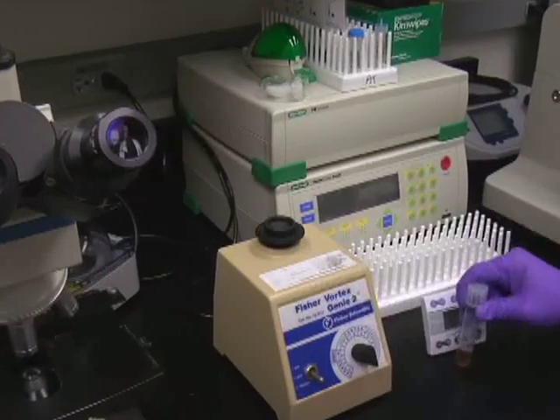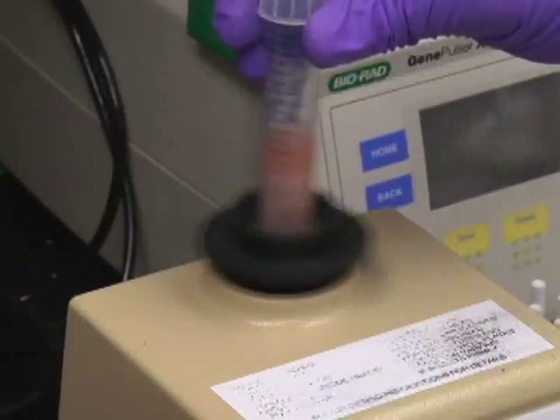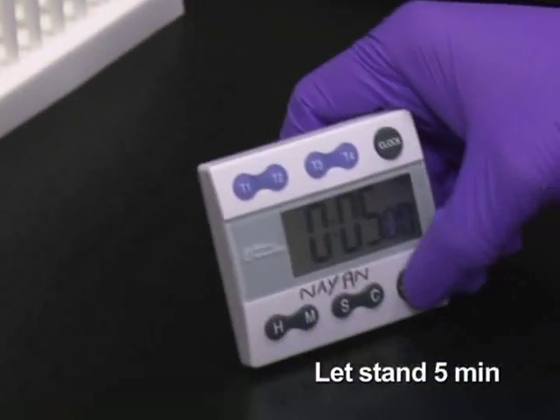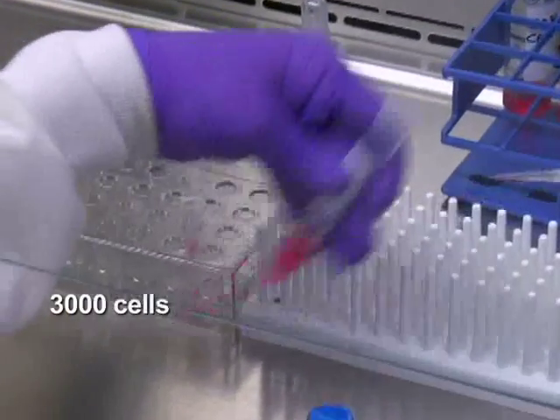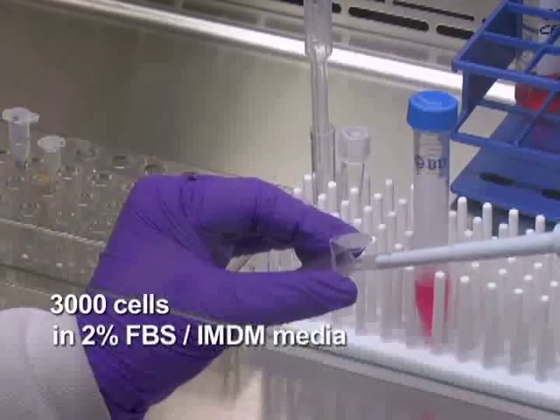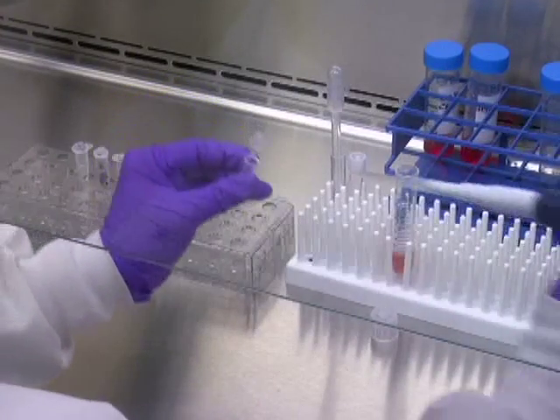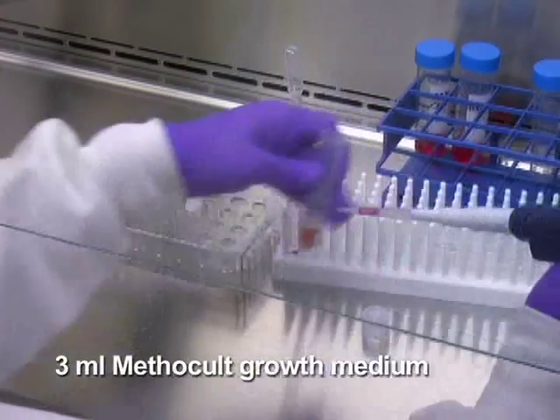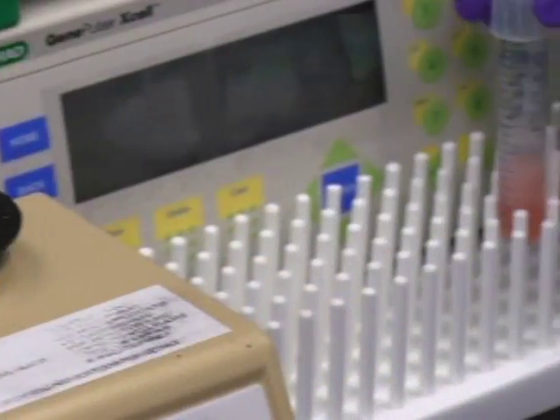Based on experimental design, thaw out the required number of aliquots of CFC assay media. Vortex vigorously to mix and let the tube stand for at least 5 minutes to let bubbles rise to the surface before adding cells. Now take 3000 virus-transduced sorted cells into a sterile microtube containing cold 2% FBS IMDM media and adjust the final suspension volume to 0.3 milliliters. Suspend the cells and transfer the entire cell suspension to a 3 milliliter aliquot of MethoCult growth medium. Create a homogeneous cell suspension by vortexing vigorously.